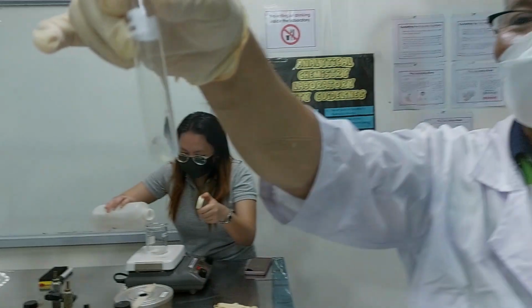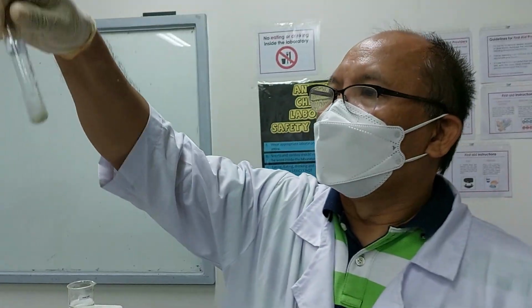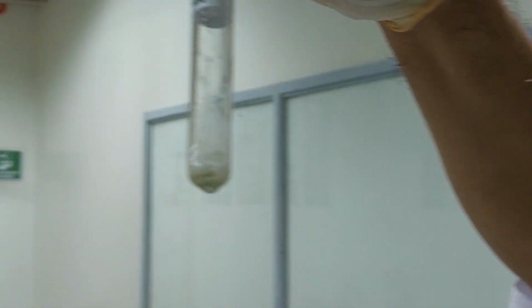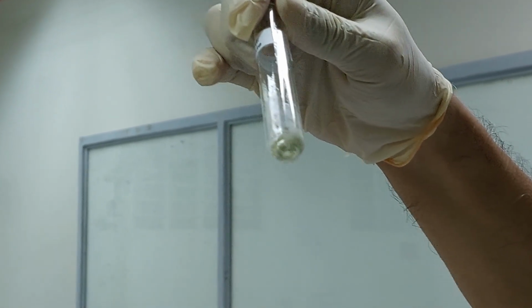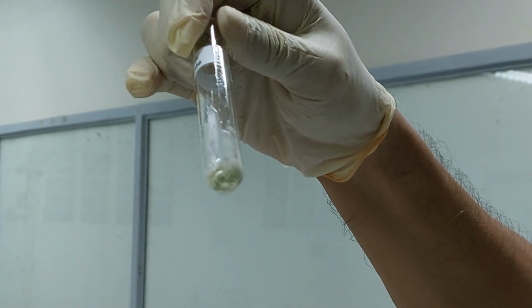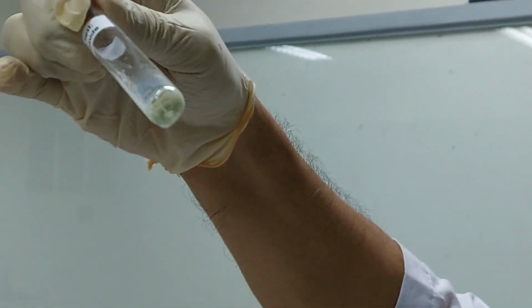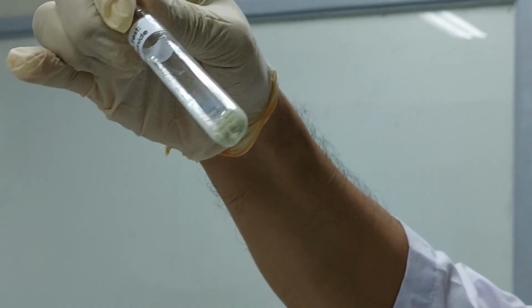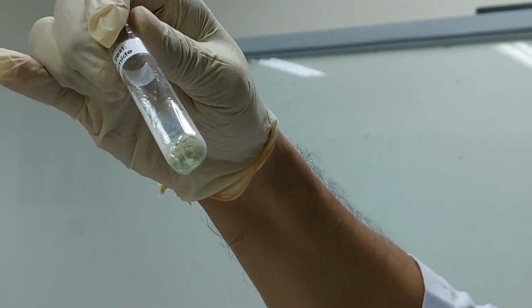Let's try to heat this one, class, if we can observe more precipitate. Alright, so this is after heating, class. If you notice, we have now the precipitate of silver bromide. So you see, try to check the correct color in Google of silver bromide. So as you can see, it's not completely white. Silver chloride is white, but silver bromide is a little dirty white, as you can see.